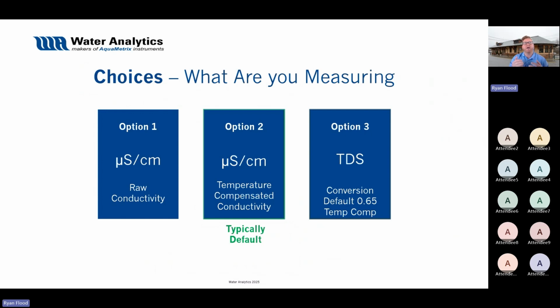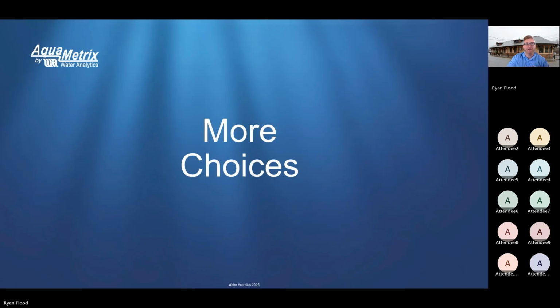With simplifying conductivity, if you want to get more precision or you want to look a little bit smarter, you can ask them those questions to see if they want to improve some of their resolution, especially if they're not happy with their current incumbent solution. There's a lot more choices that come into conductivity. So those are some of the fundamentals and basics that really help you understand what you need to do.